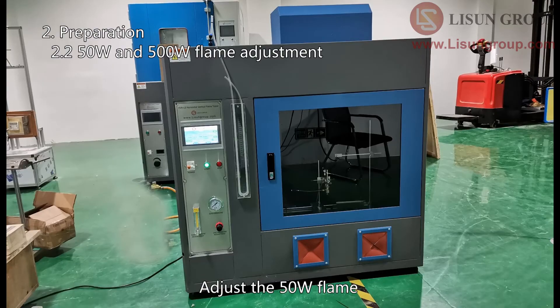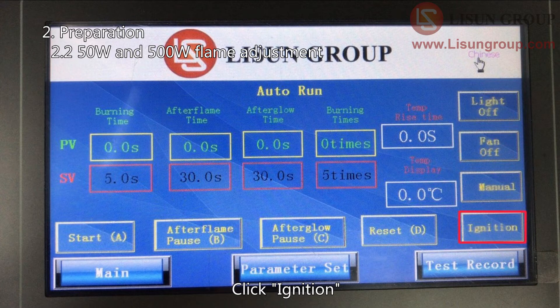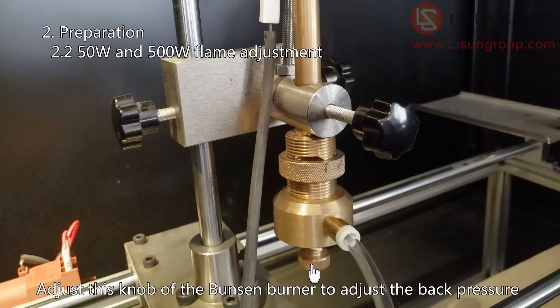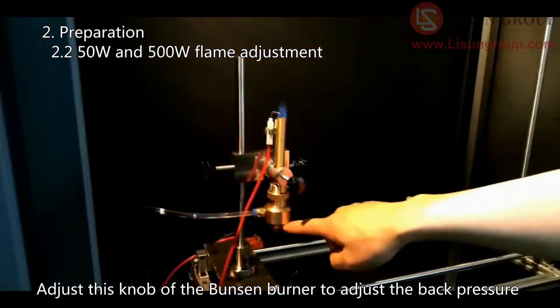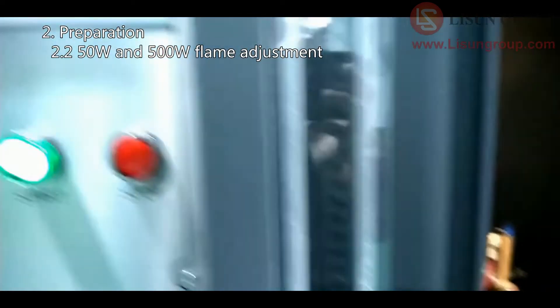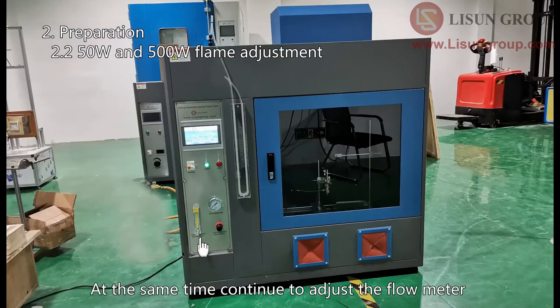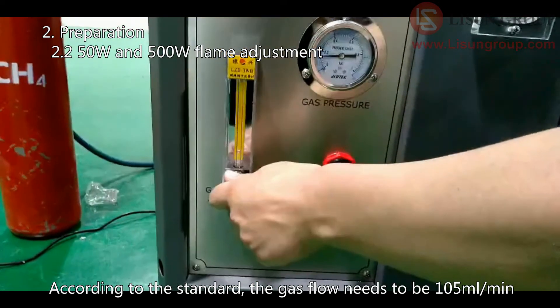Adjust the 50 Watt flame. Check the flow meter to make sure that it is open. Click Ignition. The gas of the Bunsen burner is ignited. Adjust the knob of the Bunsen burner to adjust the back pressure. At the same time, continue to adjust the flow meter. According to the standard, the gas flow needs to be 105 milliliters per minute.